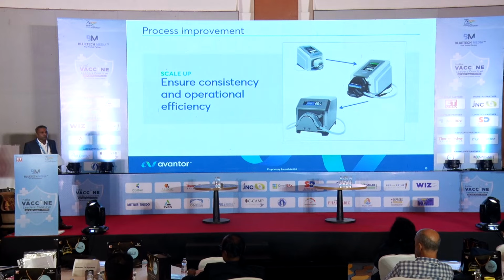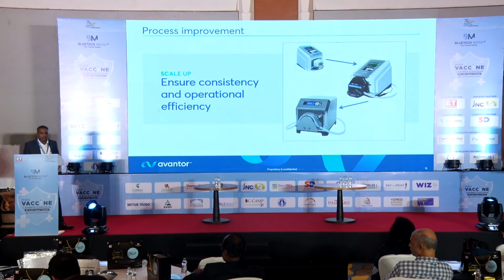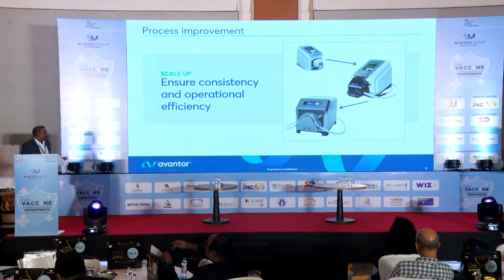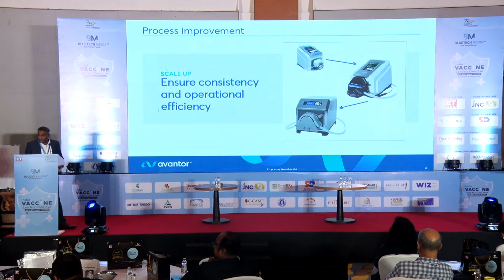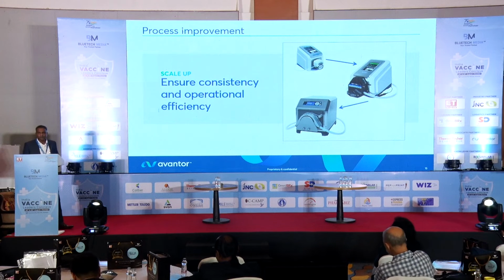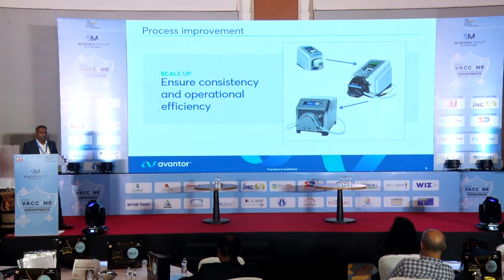As we know, throughout the biopharmaceutical process or vaccine manufacturing, peristaltic pumps have earned their value with wide flexible features. First of all, they are very accurate. Then the media or liquid never comes in contact with other parts of the pump except the tubing. So this will reduce the contamination risk. That is why pumps are preferred in the industry.